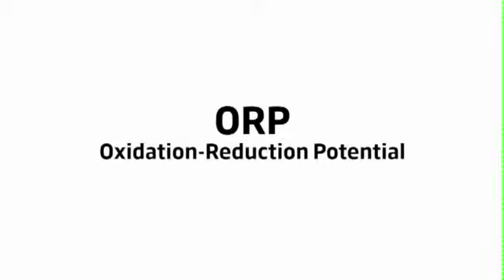Today I'm going to be demonstrating an experiment with ORP and its associated changes with a pH-dependent sanitizer. ORP, or oxidation reduction potential, simply specifies the ability of chemical species within a solution to gain or lose electrons. Oxidation is the loss of electrons, while reduction is the gain of electrons. Oxidizers will perform oxidations on other chemical species. Reducers will perform reductions. ORP is applicable for monitoring sanitation processes and chemical reactions.